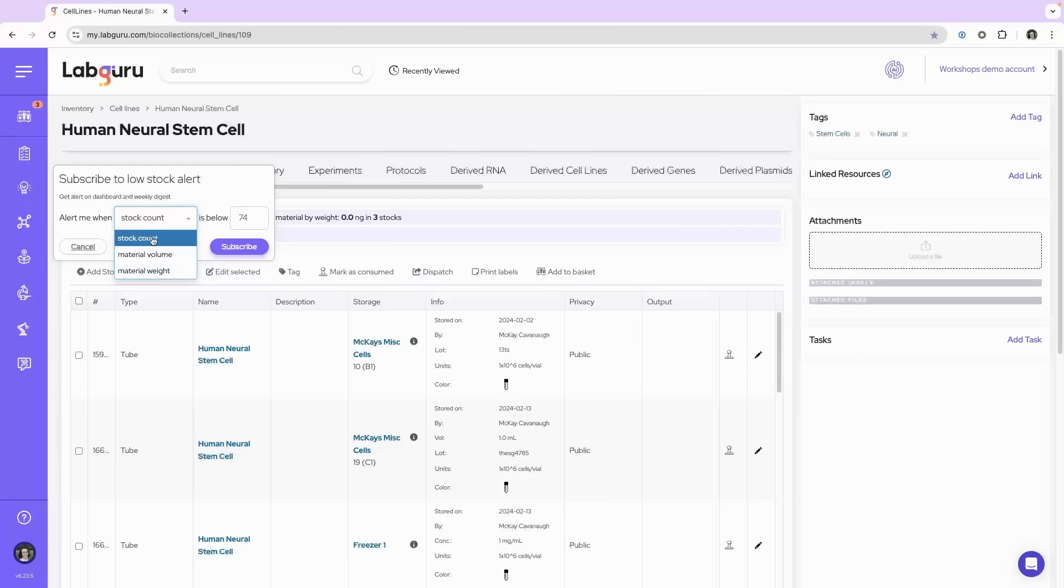So what I'll do is select stock count and now I will tell it how many stocks that threshold should be. I'm going to say the count is 50.